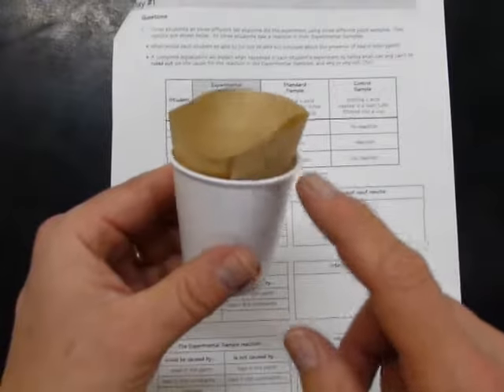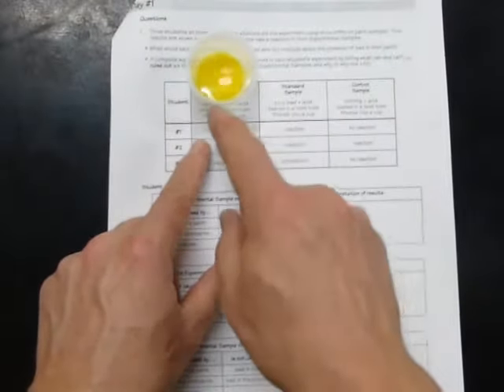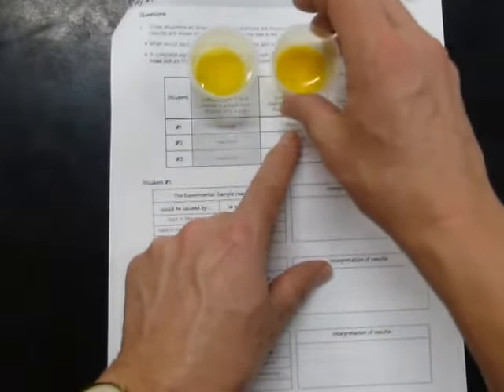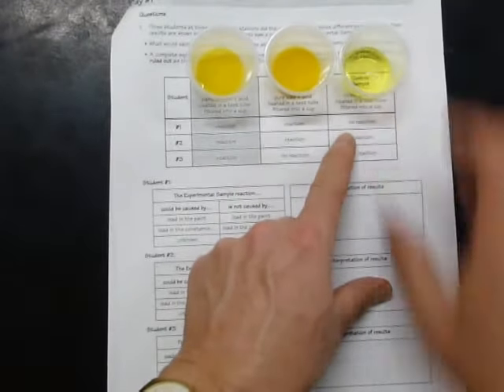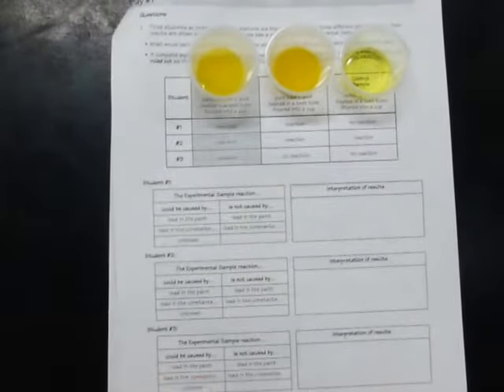And in all the experiments, all the trials, they used the same filters, the same cups, and the same kind of test tubes that had the same kind of acid in them, so that those things were all constant. And these are the results that they saw in each of those tubes. So student number 1 saw in their paint sample, the experimental sample, a yellow reaction. Student number 1 saw in the standard sample a yellow reaction. And student number 1 saw in the control sample that there was no reaction. And so we want to interpret what those results mean and what could have caused them.